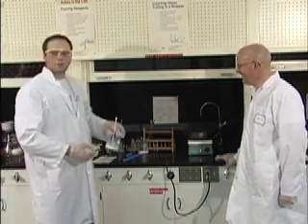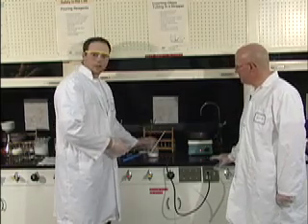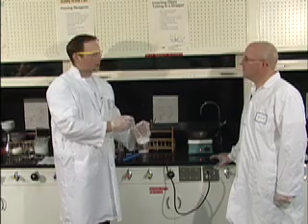Now, once you have this puck-like structure in the bottom of your beaker, what you're going to do is take a plastic spatula. Now, it's important that you use a plastic spatula. Okay? Not a glass one?